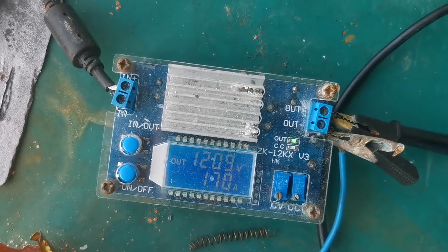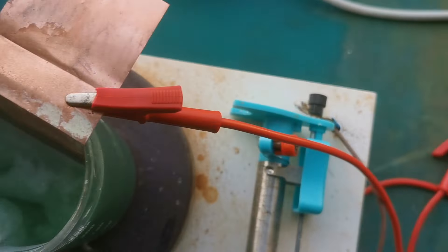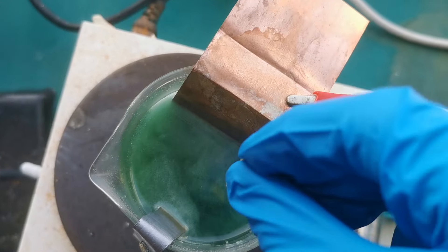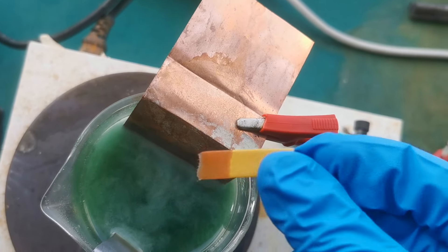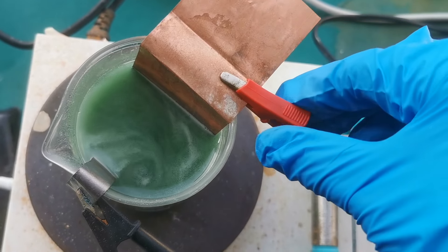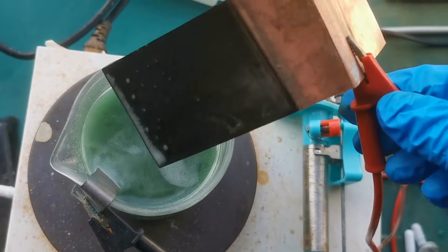The cell is now running steadily with a current of 1.7 amps. There is slight hydrogen evolution, which is not exactly desirable, but the pH is already quite high so I cannot adjust it more. After 20 minutes, the nickel coating had thickened a lot and turned black.